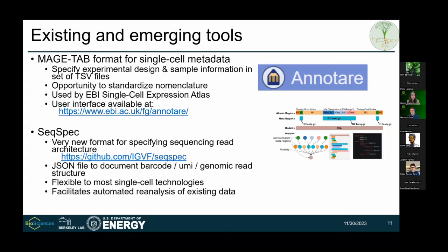There's, I'd say, not well enforced standards, but there are some standards that are out there for how you can do that, using different annotations for the genomes, gene models for different genomes. So it could be as simple as that.